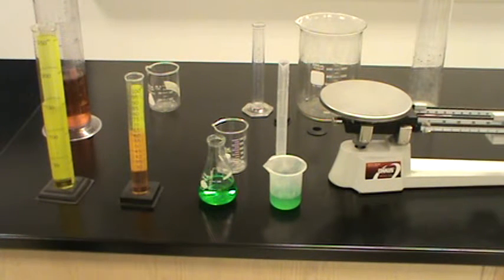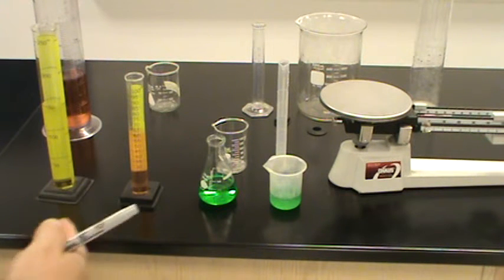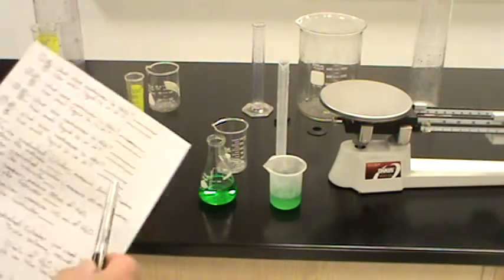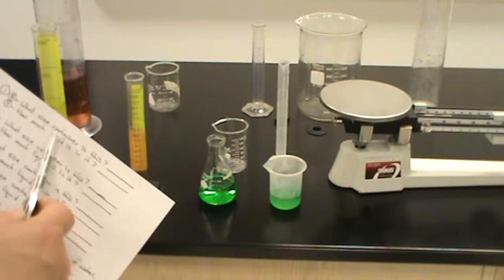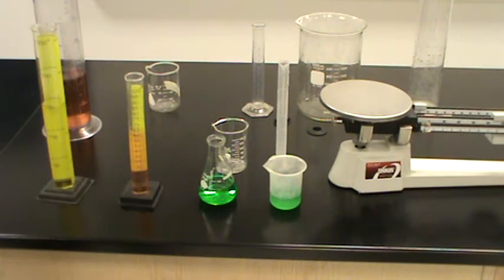Okay, for the third practicum, I asked you to come into the lab and actually measure liquid volume. And as I indicated, we were going to go from the largest down to the smallest container for questions 1, 2, 3, and 4. Each question divided into 2 parts. I wanted to know, could you identify what size of container this was, and could you tell me how much liquid was in it?